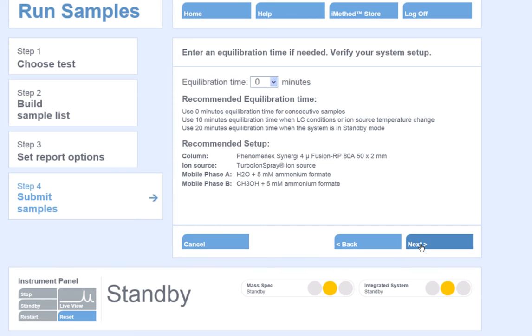Next, we will have to set up an equilibration time. This is the time that you allow the system to warm up before the first sample of the batch is injected. I will select 10 minutes.